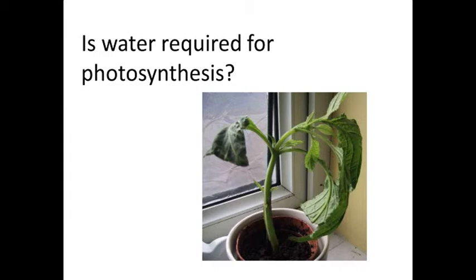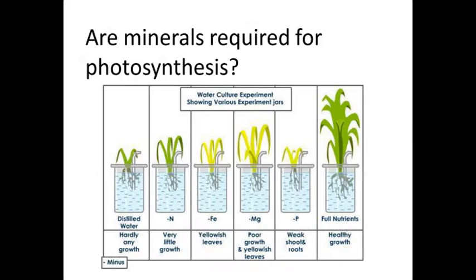We are down to our last 2 tests, and we are going to do something a bit different. The need for minerals can be tested by growing some seedlings in different mineral concentrations. We are specifically looking at nitrates and magnesium. Both of these are required to make chlorophyll, so their availability does not directly affect photosynthesis, but they can limit the availability of chlorophyll, and as we have already seen, this is vital for photosynthesis.